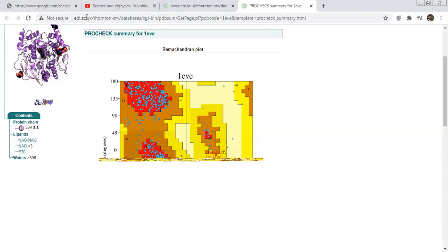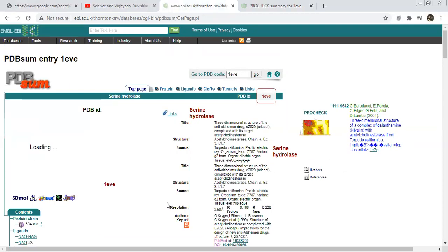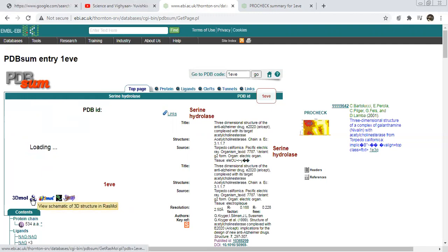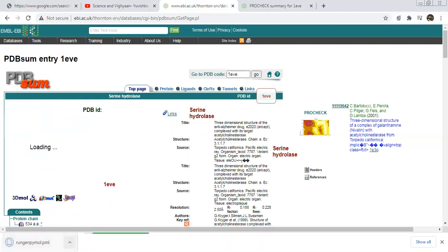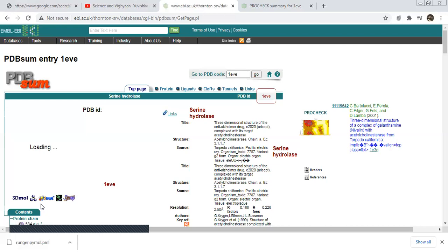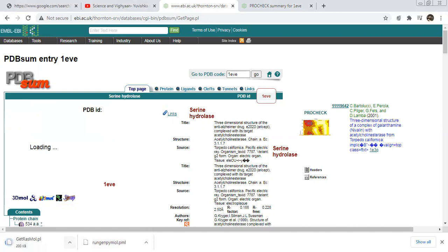We can download it also — just go there and there is an option to download. There are different formats available — we can download it in the form of PyMOL also. These are the different parameters or formats by which we can download it.